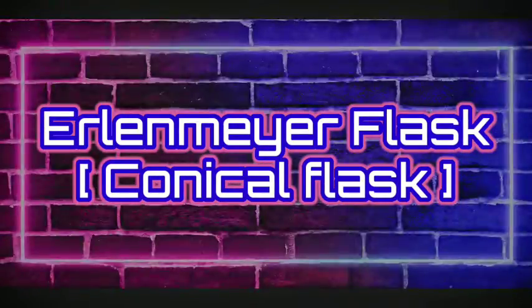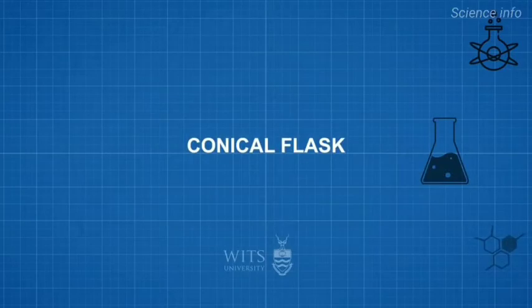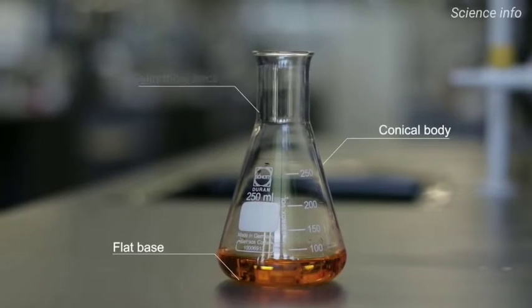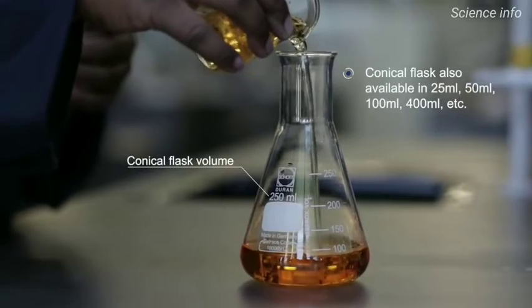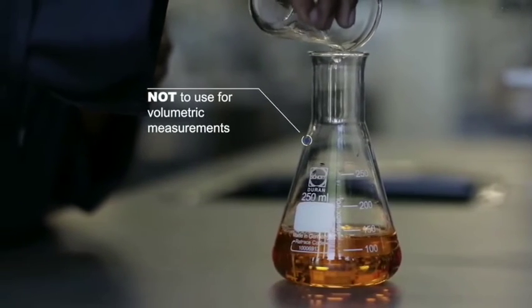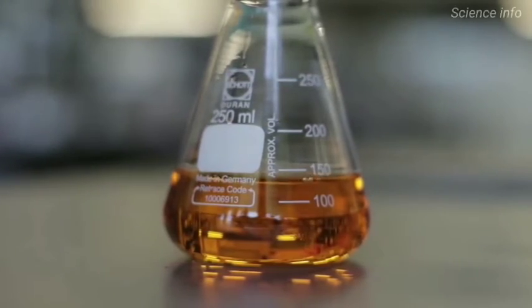Erlenmeyer flask or conical flask. It possesses a flat base, conical body, and a cylindrical neck. A conical flask is found in different volumes. This glassware is also not for accurate volumetric measurements, but is used to mix contents by swirling without the risk of spillage. One example of its use is during a titration.